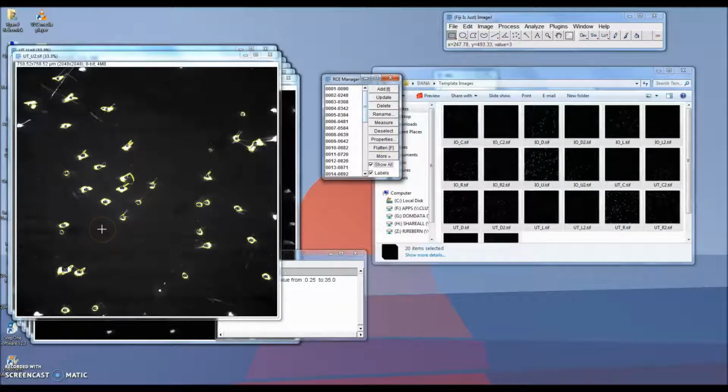And while a few of these aren't a problem, and Dana's meant to eliminate them, having too many can really reduce the quality of data that Dana Part 2 is able to produce later on. So looking at this image, I see 1 multiple. Number 8, I think, is a single cell. So it looks like, oh, we have another multiple up here, 3.